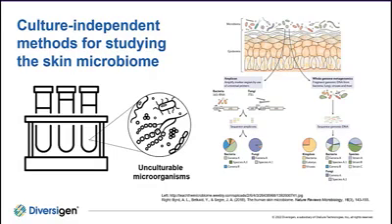Next-generation sequencing allows for the sequencing of short DNA sequences, so one or more regions of the 16S gene, which actually has 9 different regions, are selected for sequencing as proxy or model of the whole gene, which has a length of about 1,500 base pairs. For today's webinar, I'm going to be mostly talking about amplification of specific regions of the 16S gene.